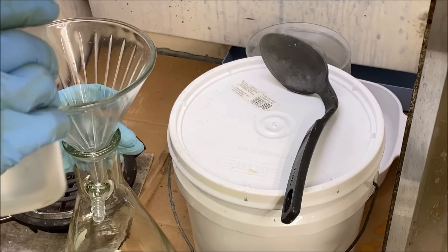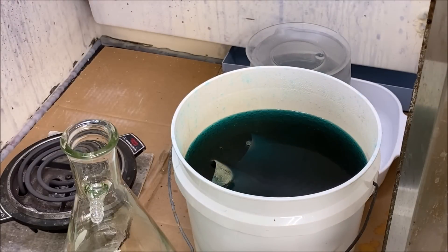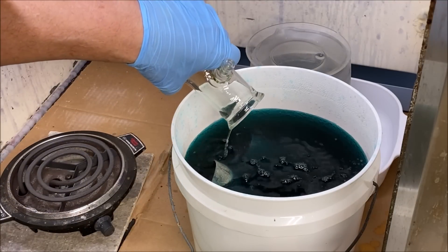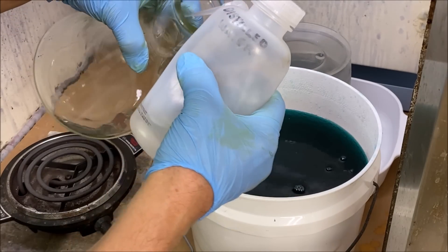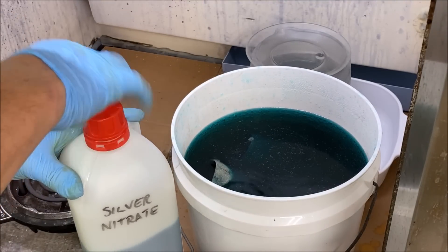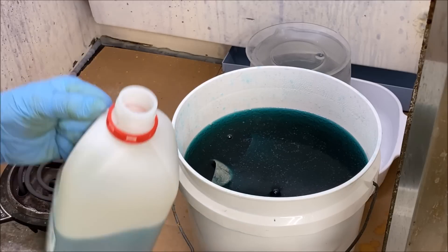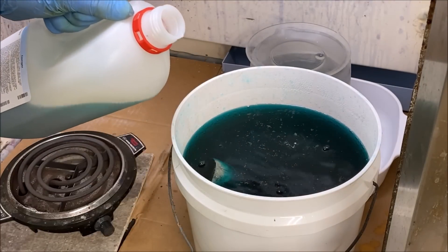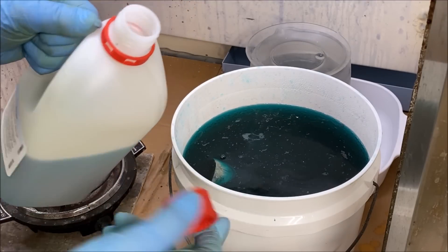I'm going to rinse the funnel out. Now I'll add the rinse from this flask — it's got a little bit of silver in it — to our cementation bucket where we're cementing the silver out onto pieces of copper. This is the silver nitrate we just filtered. I'll add a little bit into the cementation bucket. That's what we do with it: add the silver-bearing solution to the copper-filled bucket and cement the silver out.